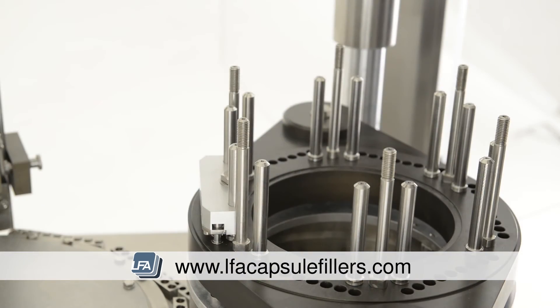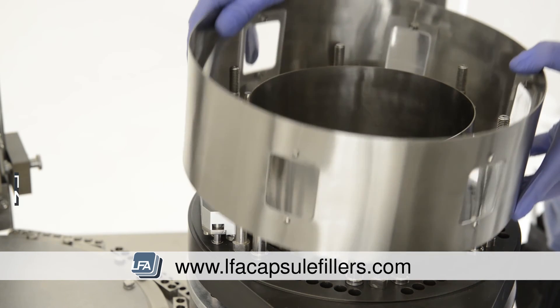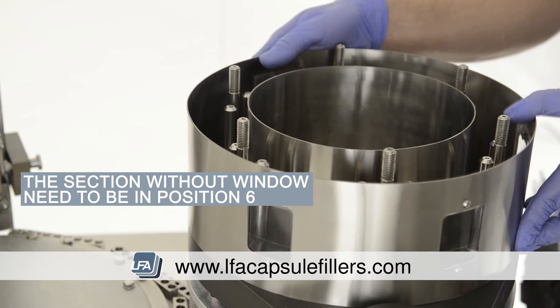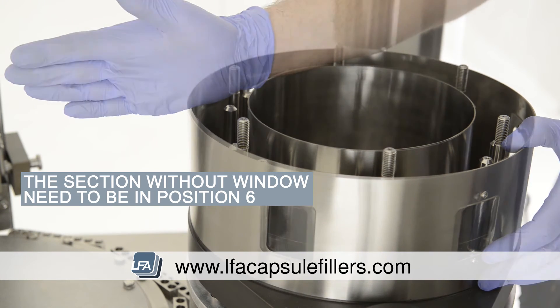Now replace the middle casing, which will just sit in the groove in the middle of the machine. You're then able to replace the outer casing. The section of the casing without a window needs to be in station 6, facing towards the middle of the main turret. The other windows need to be facing stations 1 to 5.